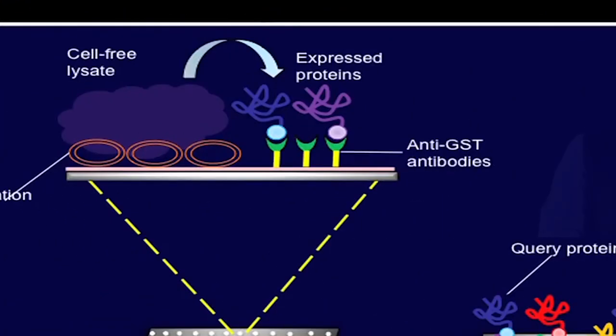The next case study is performed by Ramachandran et al. 2004 to identify novel protein-protein interactions using NAPA microarrays. Authors reported generation of self-assembling microarrays, which was one of the novel technologies reported in Science in 2004. In this study, Ramachandran et al. used a pairwise interaction among 29 human DNA replication initiating proteins, which recapitulated the regulation of CDT1 binding to the selected replication proteins and mapped its geminin binding domain by using the NAPA approach. Let me describe some of the steps involved in this experiment by showing you this animation.